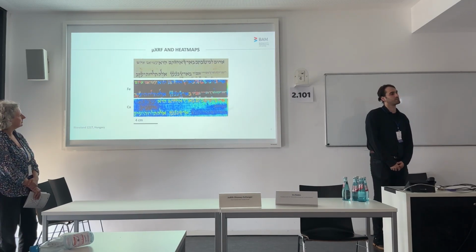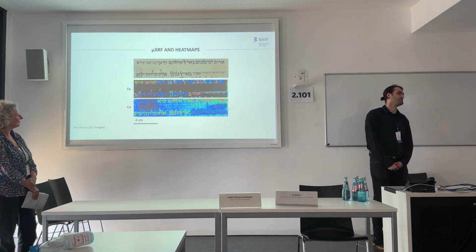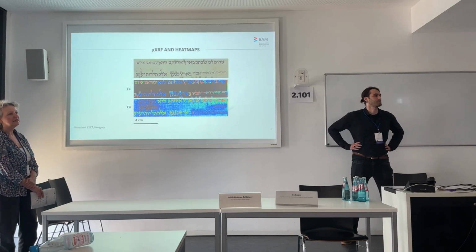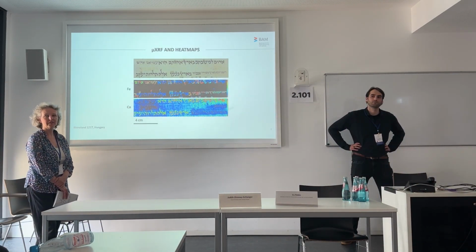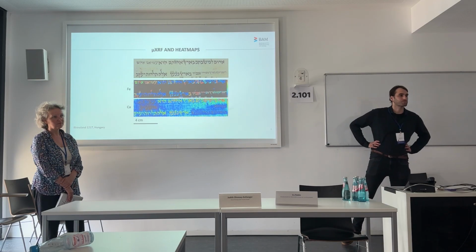Just how do you conclude that they didn't just shape the letter and then immediately add it? Well, this we cannot say when. Yeah, that's what I'm asking. No, this we can, because in this case you have this typical makeup of one ink. Now, you add something which is very thin. It will be even colder in the color if it was the same, because the crowns are very thin and they don't have that much ink, right? So you can't date ink, but you can say relatively this was later. It might have been 5 minutes later. It could have been a day later, but it was later.